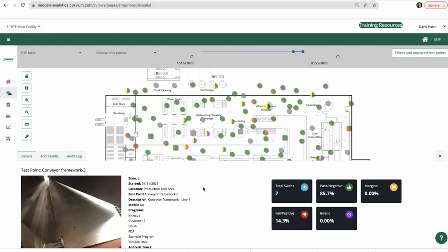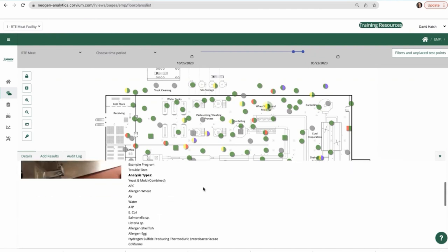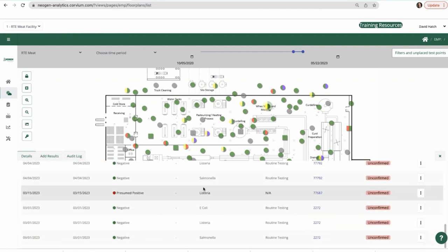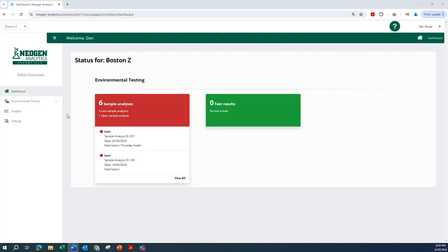Selecting a specific test point details every test and result performed at that location, full audit log of activities, and any corrective actions related to the location.